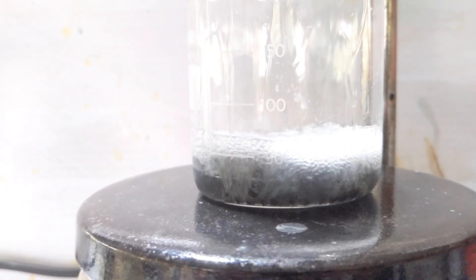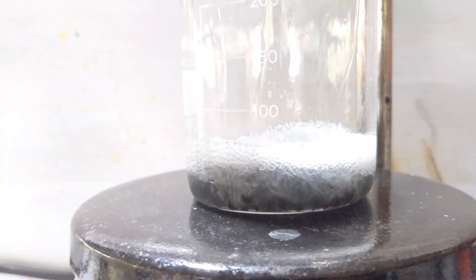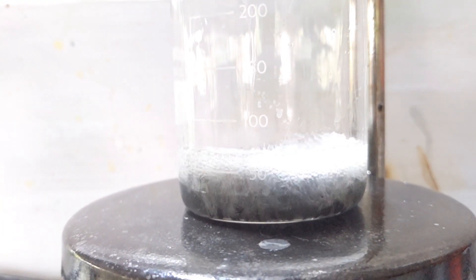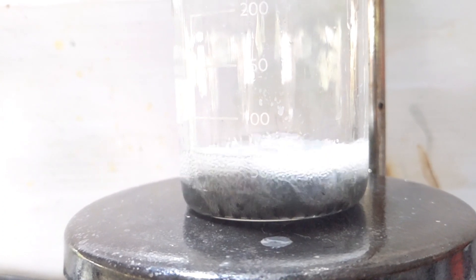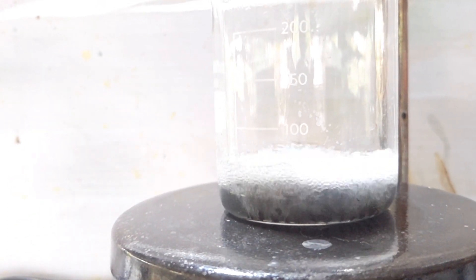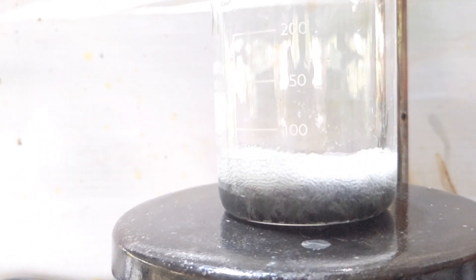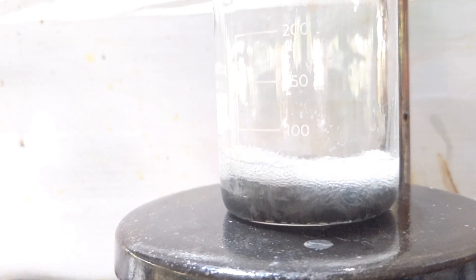Soon a vigorous reaction start to take place with the glacial acetic acid and a lot of bubbling occurs. This is why I used a relatively bigger reaction vessel for the small amount of reactants as there was a lot of splashing going on.